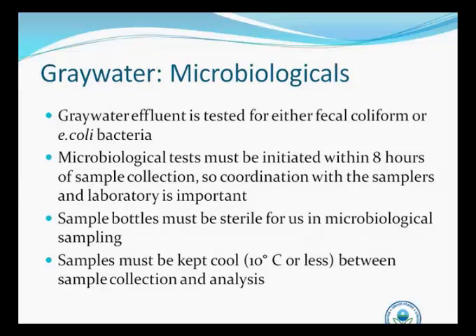Once again, using clean techniques, clean bottles. Most labs will have commercially prepared sterile bottles, and these often have a seal, so it's good to look for that when you're observing the sampling going on, just to make sure that the lab is using clean bottles. Another important component of microbiological testing is that the samples have to be cooled immediately and kept cool between the time of sample collection and analysis. These bacteria reproduce highly rapidly at room temperatures, maybe even once up to every 15 minutes. So it's really important to cool these samples quickly and then to stop any kind of growth of bacteria after the sample is collected.